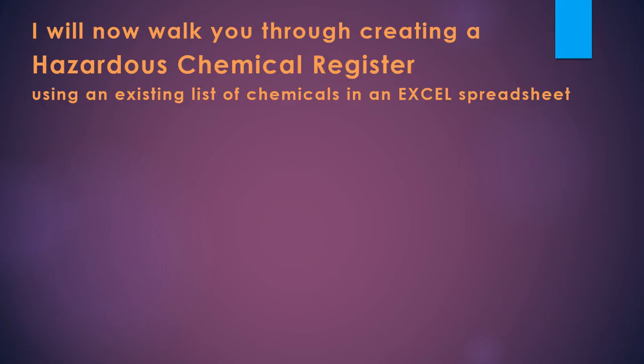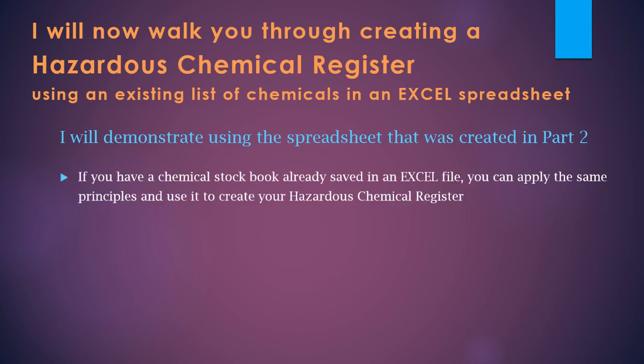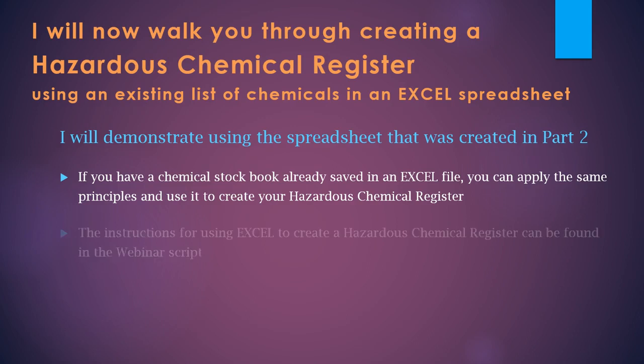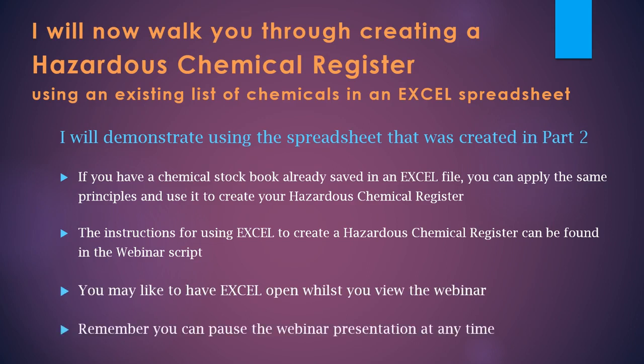I'll now walk you through creating a hazardous chemical register using an existing list of chemicals in an Excel spreadsheet. I will demonstrate this using the spreadsheet that we created in part two. If you have a chemical stock book already saved in an Excel file, you can apply the same principles and use it to create your hazardous chemical register. The instructions for using Excel to create a hazardous chemical register can be found in the webinar script. You may like to have Excel open whilst you view the webinar and remember you can pause the webinar presentation at any time.